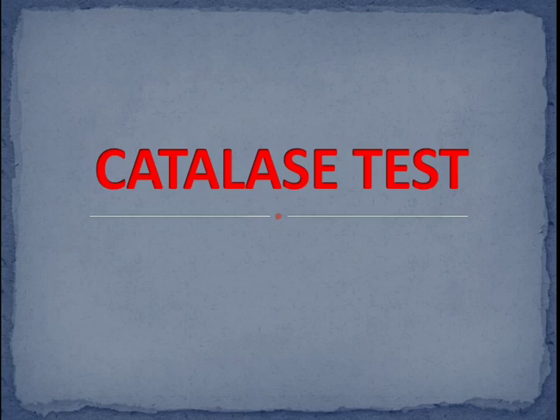In today's lecture, we will discuss about catalase test, a common biochemical reaction done to differentiate between Staphylococcus species and Streptococcus species.